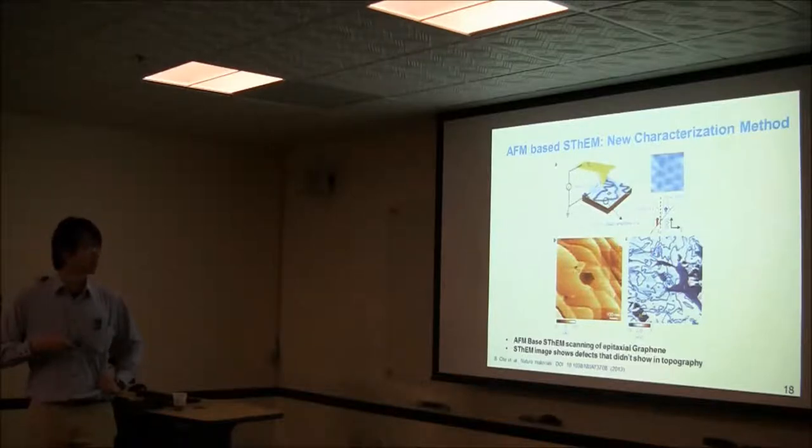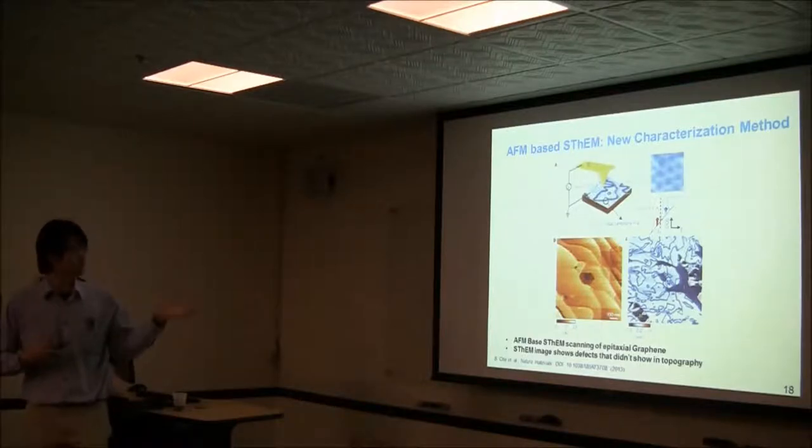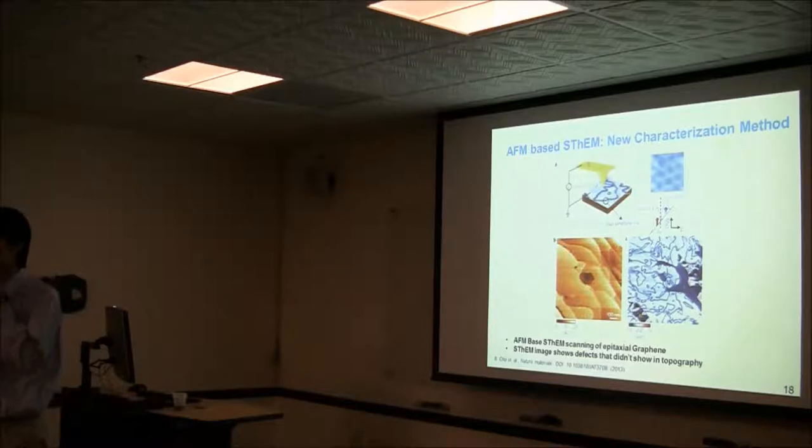So this is also kind of exciting. You can also see that in the voltage, you have negative and positive. They also found some areas where they intentionally did n-type doping, but got some kind of p-type doping in some areas. This is also something new. You see this spatial resolution based on the mean free path for the phonons?